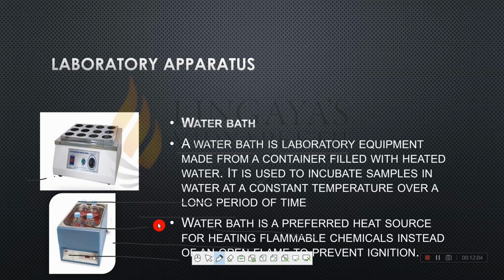Moving on, now talking about the water bath. A water bath is a laboratory equipment which is needed to heat the fluid or any kind of solution, as well as for incubating the liquid or the solutions. For example, if any test requires a certain temperature to be reached, then we put the glass test tubes or the solutions into the water bath so that the temperature will be attained. So for reaching different temperatures, a water bath is used.